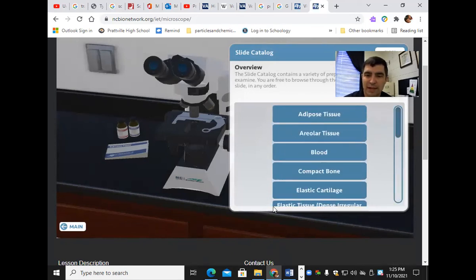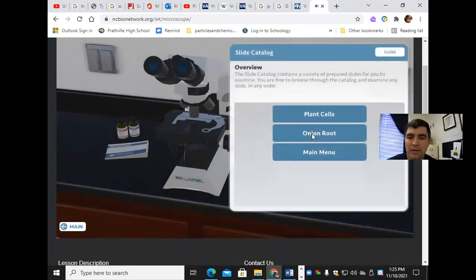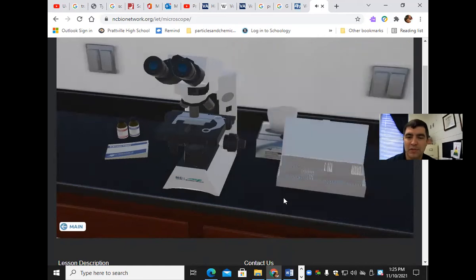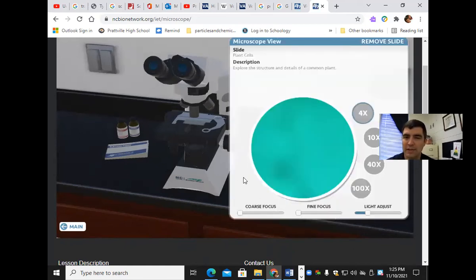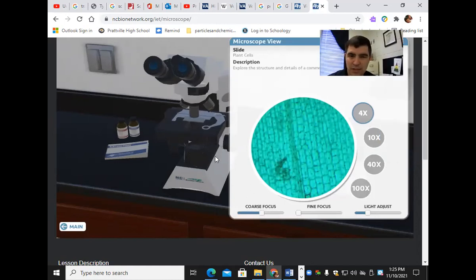I'm going to first look at plant cells. So far this is my virtual microscope view. I'm going to use my coarse adjustment first, and you can start to see through the microscope — it's almost like a real microscope. Then I use my fine adjustment to make it a little bit clearer, and I can adjust the amount of light I let in.